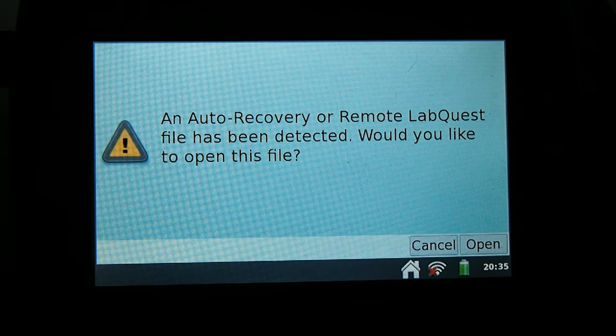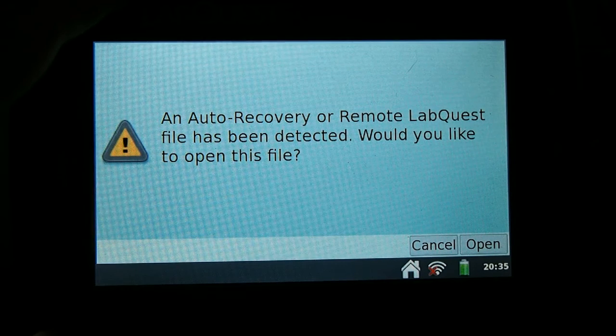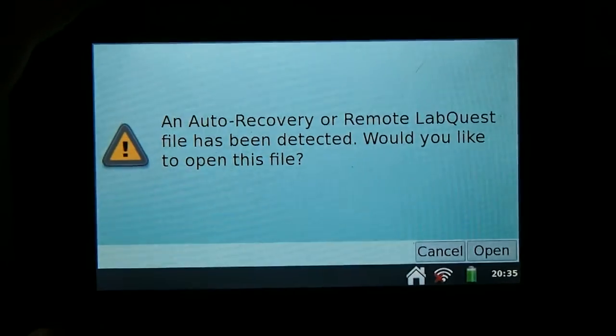When the setup is complete, you may see this indication to show that there's data on this device already. This merely means that the students had previously used it. You can press cancel to avoid this.